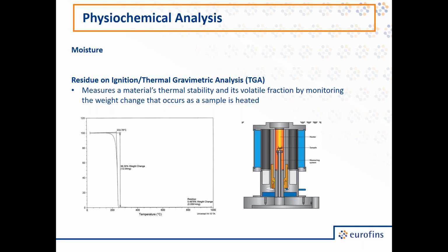There are many other types of physical tests. Another common one that we're not showing a slide for is differential scanning calorimetry, or DSC. This one, which also works alongside TGA, gives us information like melting points, freezing points, and also monitors the energy required to freeze a material or to boil a material. So if you need to use energy to heat up a sample, or you need to use energy to cool a sample, we can measure the amount of energy you need to do that, and that helps with designing or working on production lines.